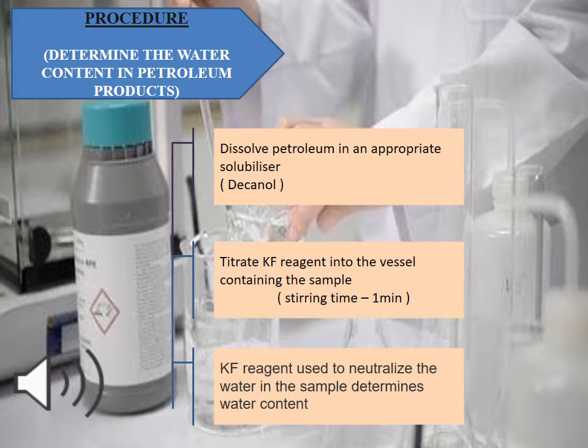We all know that petroleum products are mixtures of long chain or aromatic hydrocarbons, and these hydrocarbons are hardly soluble. The saturated hydrocarbons are mostly titrated easily, but there are solubility problems. In order to overcome these solubility problems, because of the presence of non-polar or weakly polar substances, the addition of solubilizers to the solvent is very much necessary.